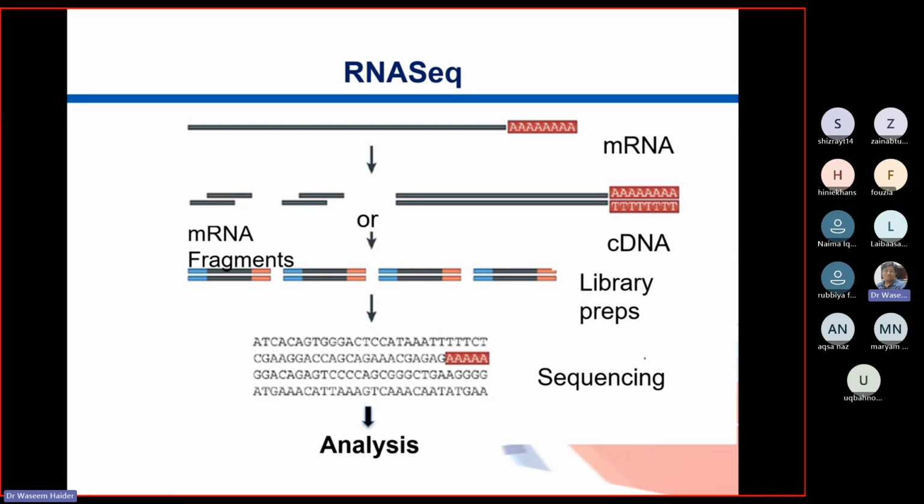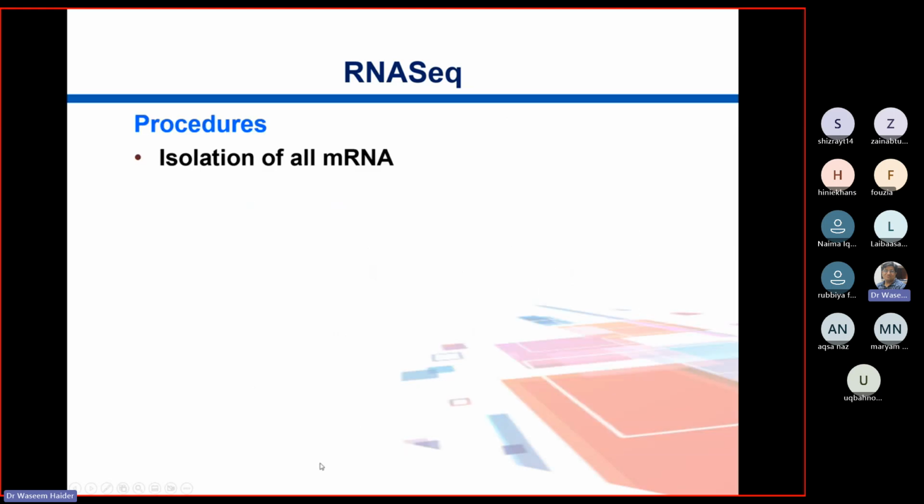This is done once per messenger RNA copy produced. So obviously there is a trade-off. If that RNA stays within the cell, that is dangerous, so that has to be cleaved or removed. That's why uracils are placed. So what you do next is, now this thing is cDNA, and then again you do the fragmentation and you do sequencing and then you do analysis.